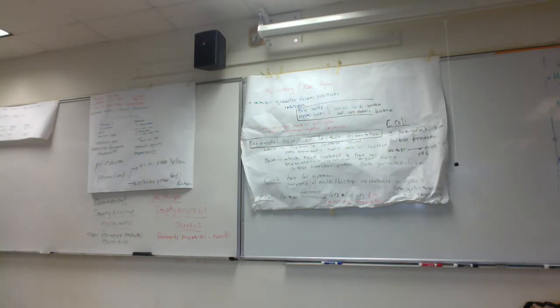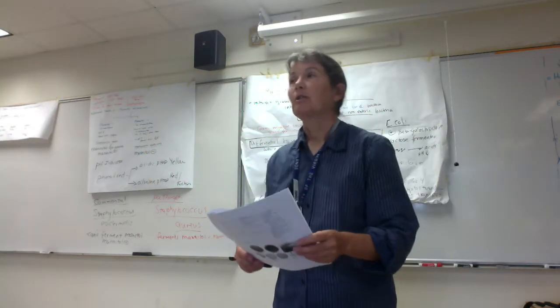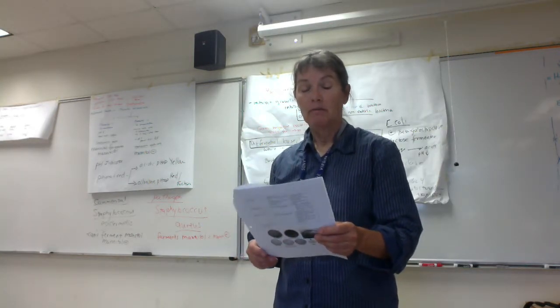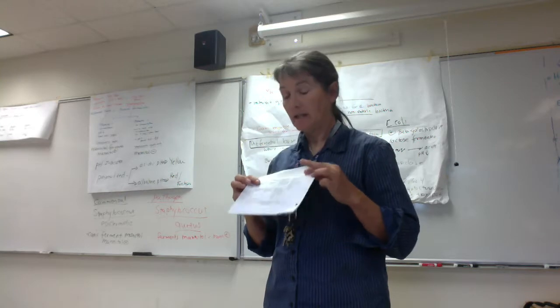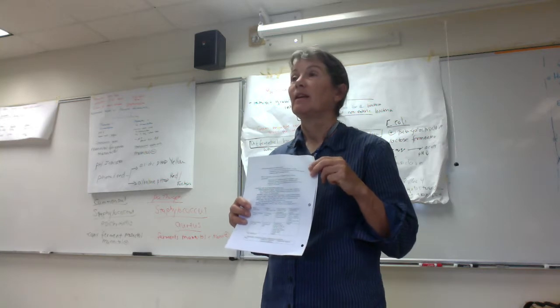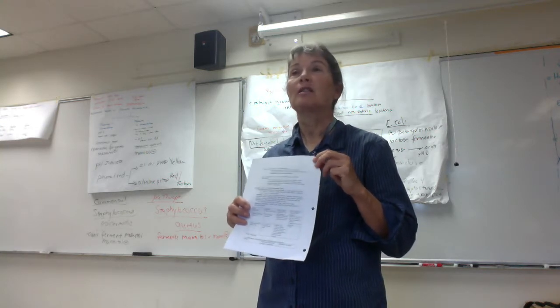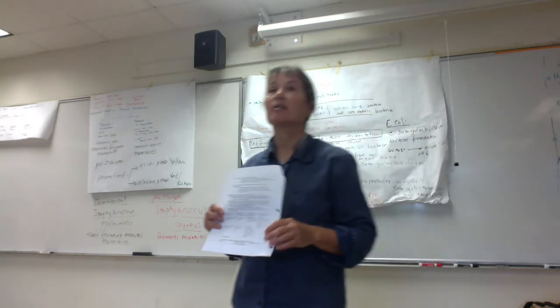Okay, I'll keep the sample plates up here. The MSA plates, we'll keep up here in line with the concept map, all right? Okay, folks, the last one we're going to talk about is a little bit more complicated. The last selective and differential media we're going to talk about is called MacConkey's agar, or MAC. On page two of your handout, you'll see it listed under selective. MacConkey's is used to select for gram-negative enteric bacteria, enteric referring to microbes that can live in the intestinal tract, right?